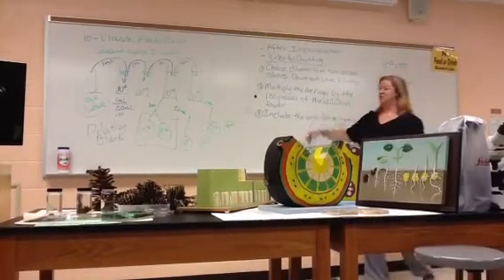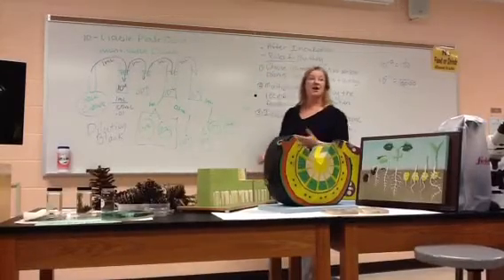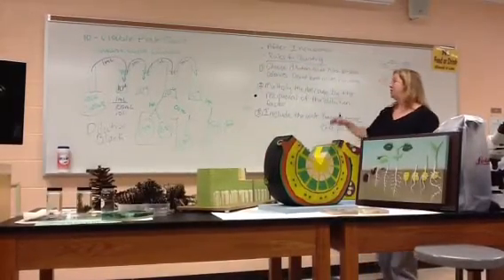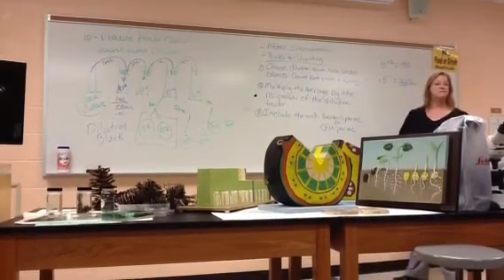So you made 2 duplicates. You've got to count each bacteria on each plate, and then average them together. Add those 2 numbers and divide by 2, to get an average from both plates.